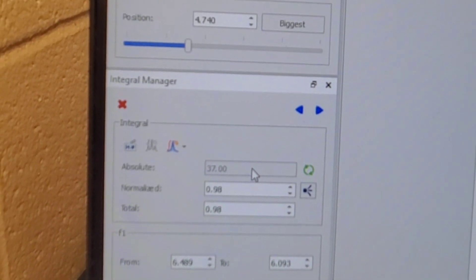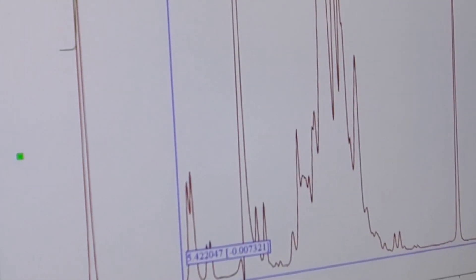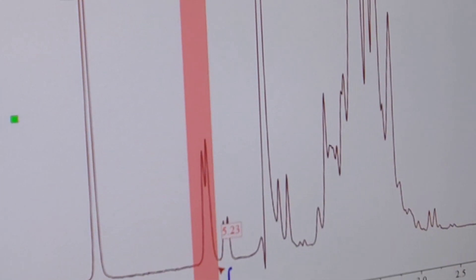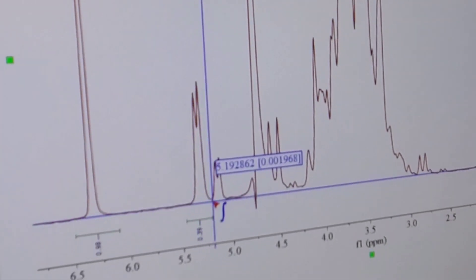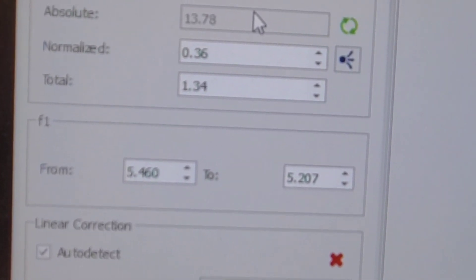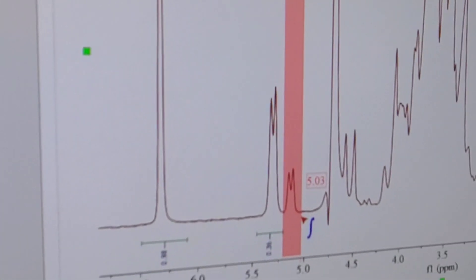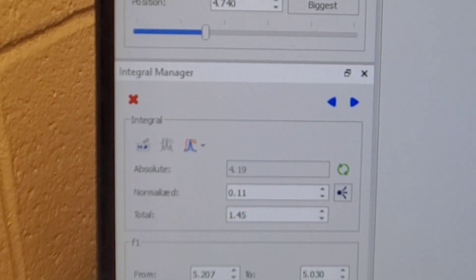For sucrose, start a little before the peak and go just past it. Notice the baseline isn't perfectly straight, so hit auto detect for linear correction — that drops from about 14.86 down to 13.78, and that's the value we'd take. For alpha glucose, the absolute is 5.13, and with auto detect it goes to 4.19.